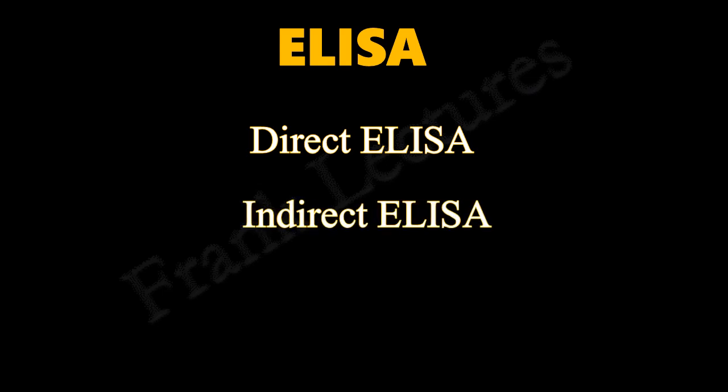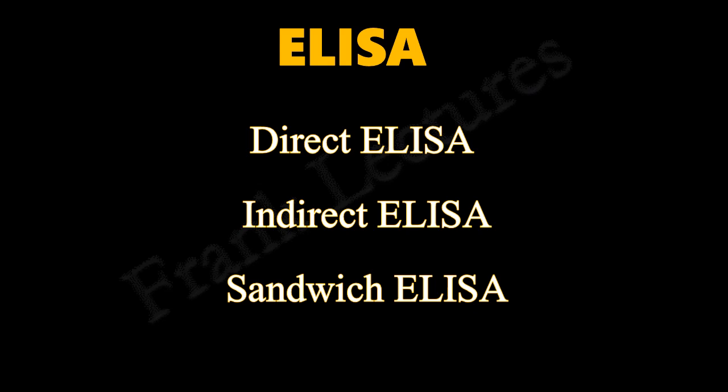There are three main formats of ELISA. These are direct ELISA, indirect ELISA, and sandwich ELISA. In this video lecture we will study direct ELISA.